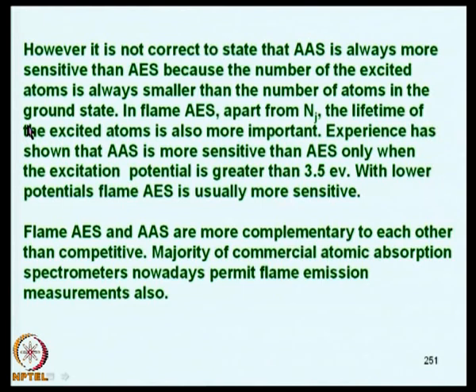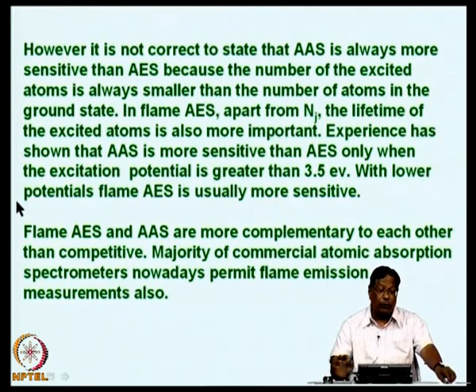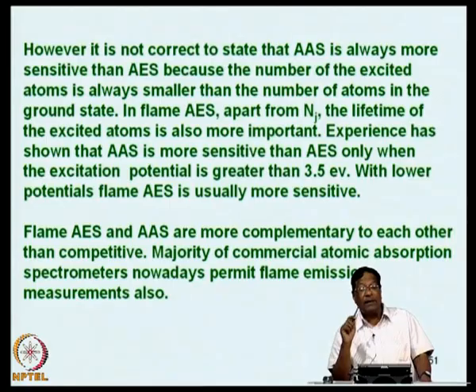However, it is not correct to state that atomic absorption is always more sensitive than atomic emission spectrometry. The statement that AAS is always more sensitive than AES is made quite often, and that is not really correct, because the number of the excited atoms is always smaller than the number of atoms in the ground state. This is the basic premise that we work with.